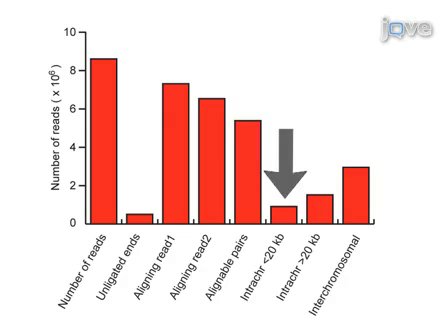15% represent intrachromosomal interactions between fragments less than 20 kilobases apart, and 30% are intrachromosomal read pairs that are more than 20 kilobases apart. This distribution may be sampled prior to high-throughput sequencing as a form of quality control. Cloning and Sanger sequencing around 100 clones is usually sufficient.